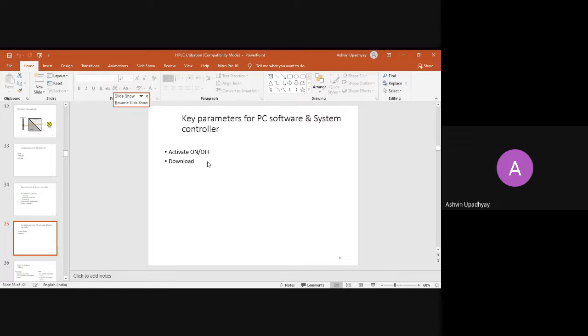Okay, so after that, with the PC software, all the data will be captured for a lifelong period, and it can be referred to anytime by any analyst anywhere. You can refer to all the data available on your PC, for example, that X number of batch contained impurity A at 0.02%, impurity B at 0.5%, likewise. So you may have the trend of all your products, all batches, with respect to the PC control.